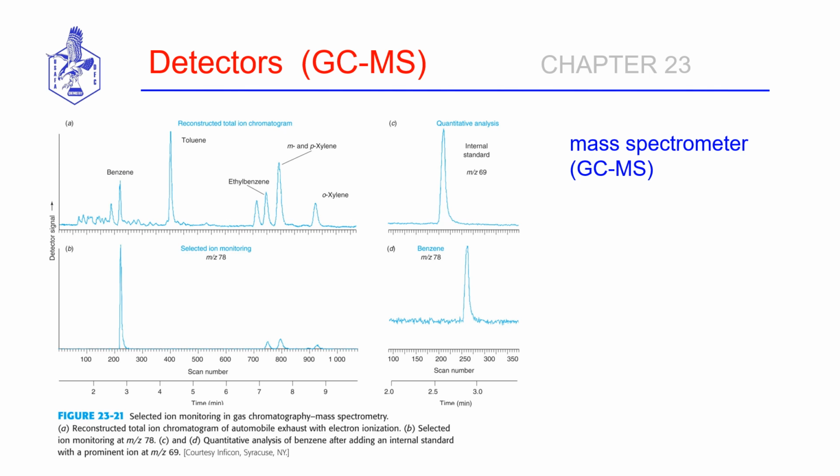So the technique is respected and the data stands up in court. A mass spectrometer can be a very sensitive detector. We have very low detection limits, and then once again we have the positive structural identification of the components present in the sample. These instruments are prolific. They're present in many analysis labs.